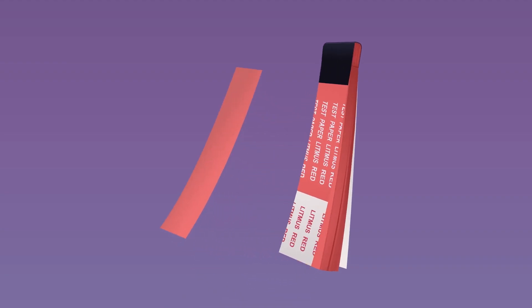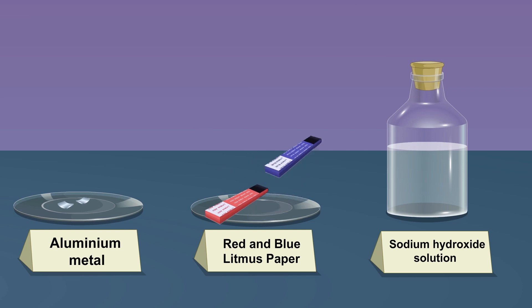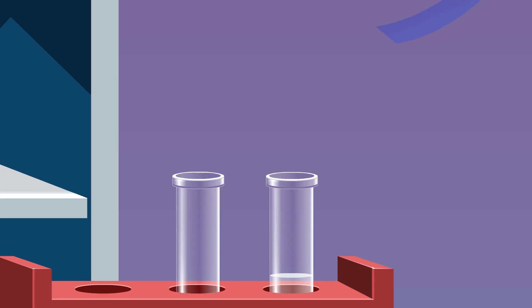Conduct a litmus test by bringing the moist blue and red litmus papers to the mouth of the test tube when gas is liberating. We observe that red litmus stays red, and blue litmus stays blue.